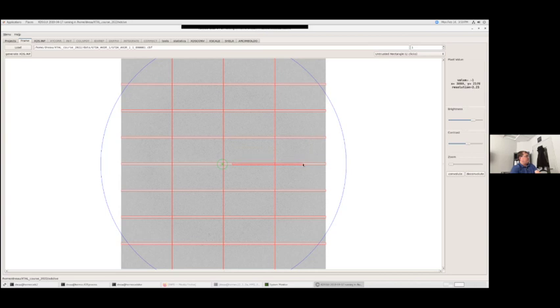Oh, it's a right click. So in that case, the 2 clicks are right clicks on the mouse. Okay. An ellipse is similar. Think of this as you're defining the rectangle in which the ellipse is inscribed. So if I right click once, as I drag out, I can make it more circular. I can make it really elliptical. I can make it bigger or smaller. And then it's going to mask out that region. And then when I got that set up the way I want, I can right click.